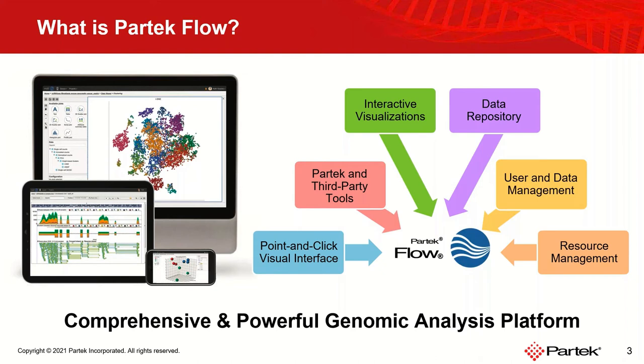With Partek Flow, there is no need for command line or knowledge of a programming language. All the analyses are performed using a point-and-click interface. In addition to our own algorithms, Partek Flow ships with a number of commonly used tools, and you can also add your own tools or scripts. Finally, Partek Flow includes user and data management as well as resource management tools.